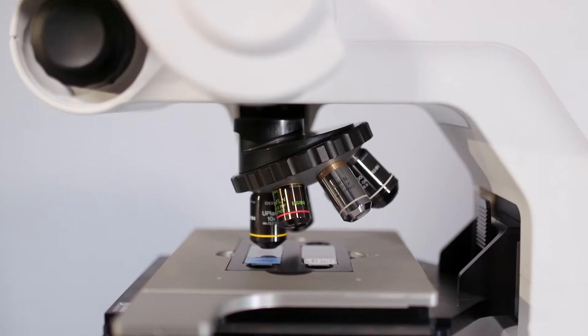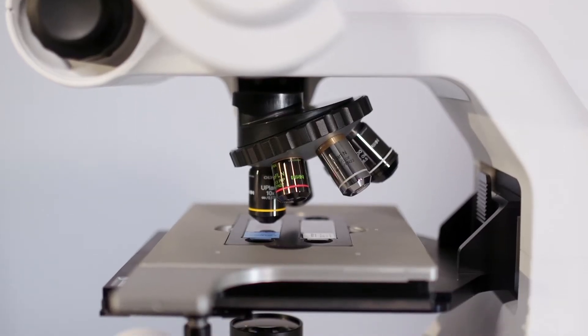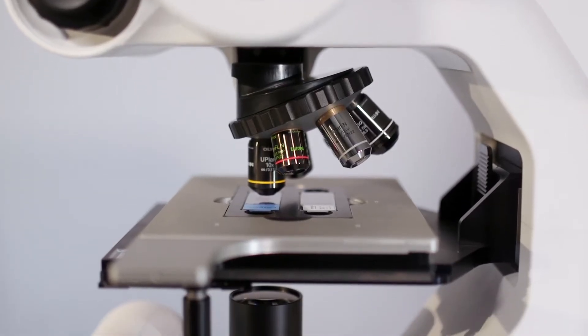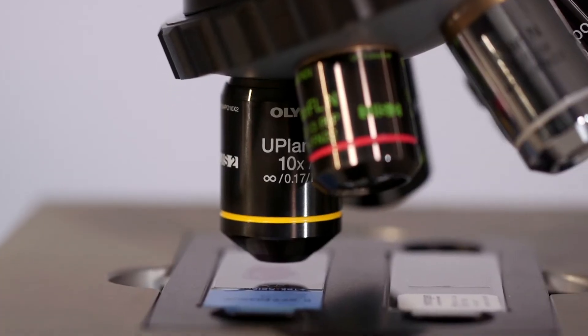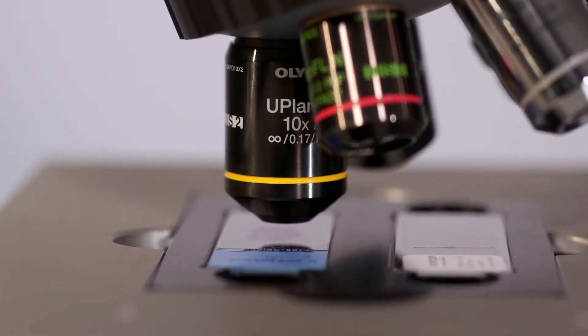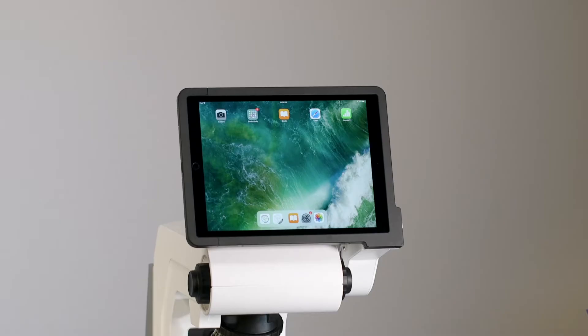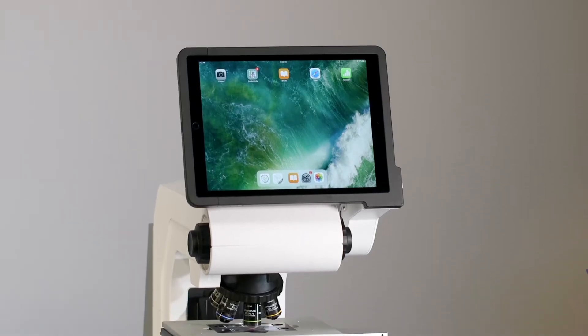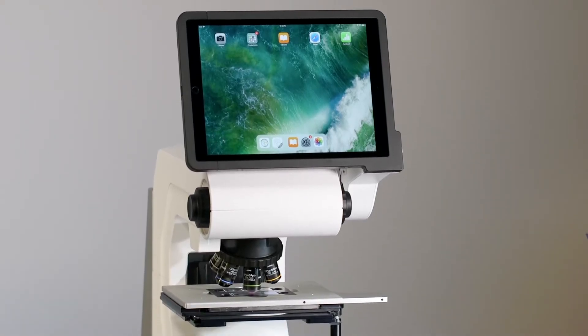We designed the Revolve based on three core principles. One, quality. We use world-class components including Olympus Optics, Chroma sputter-coated filter sets, as well as Apple's iPad Pro.